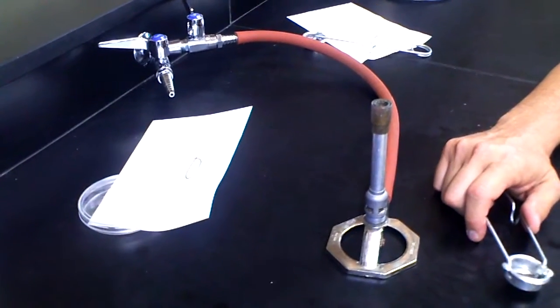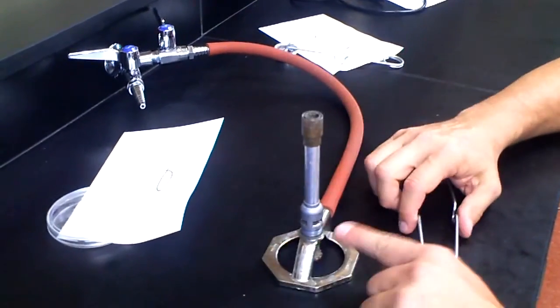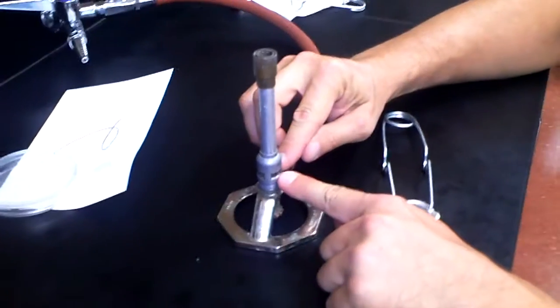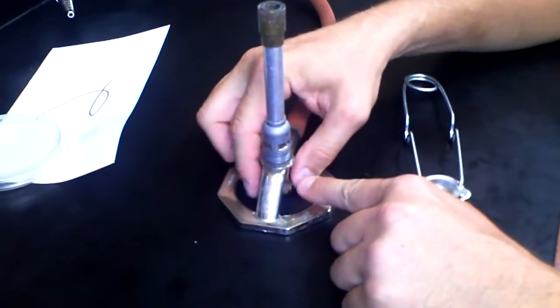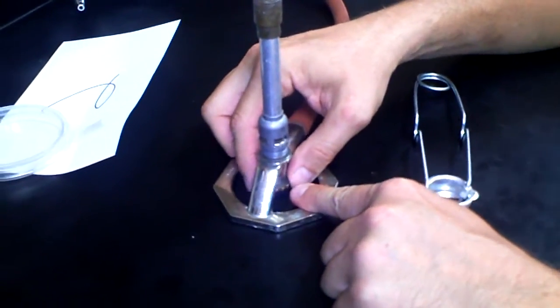When we light the Bunsen burner, we want to make sure we have our safety goggles on. We want to make sure that our air intake valve is open to the brass nut, and then we have some opening at the bottom of our valve.